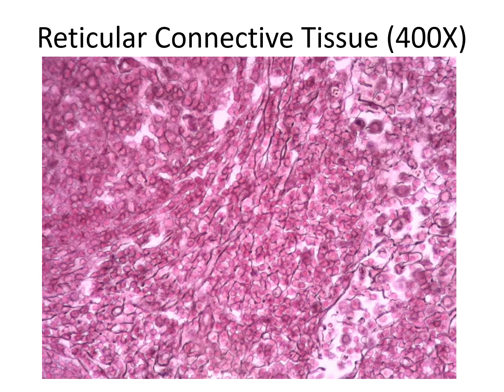Reticular connective tissue. This is how a slide of our reticular connective tissue looks like. And over here, again, what you guys can see, those are our reticular fibers. They are short and they branch, right? So again, just please try to remember how reticular connective tissue looks like.